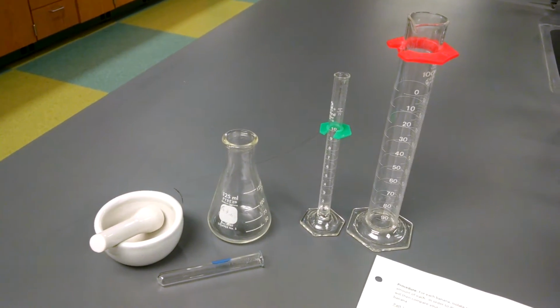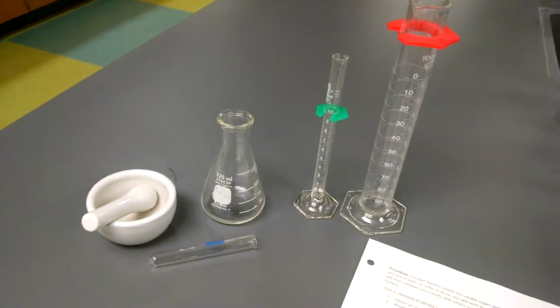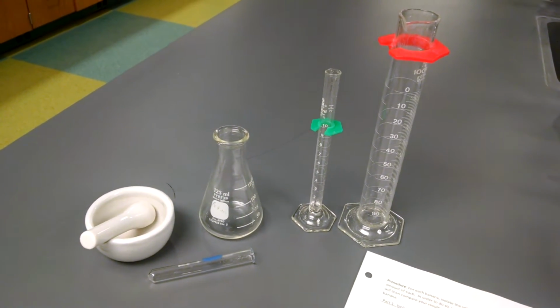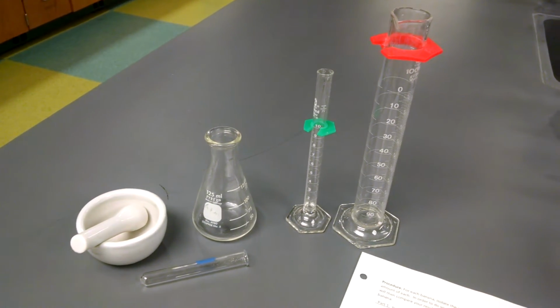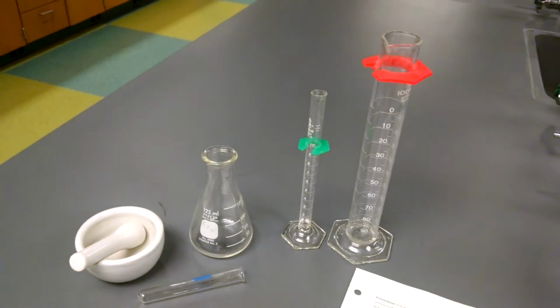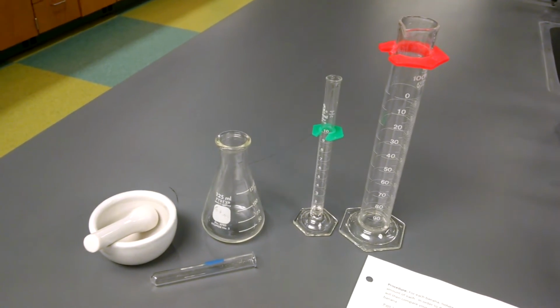In today's lab, we are going to be separating bananas into their soluble and insoluble parts. The soluble part of a banana is the sugar. The insoluble part of the banana is the starch, and we'll be comparing which type of banana has more starch and which has more sugar. We'll be using ripe bananas, extremely ripe bananas, and then some green bananas.